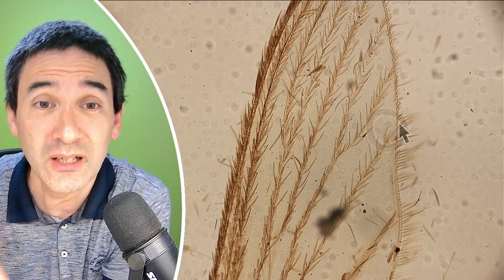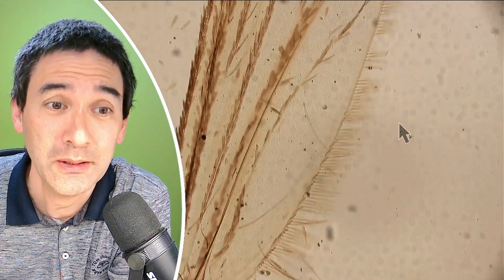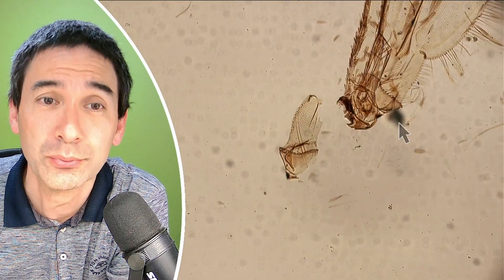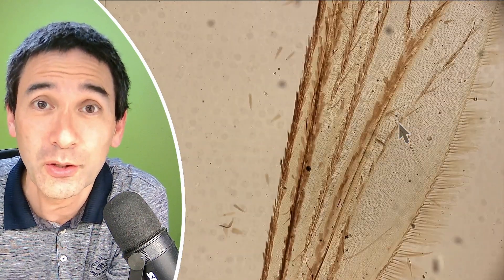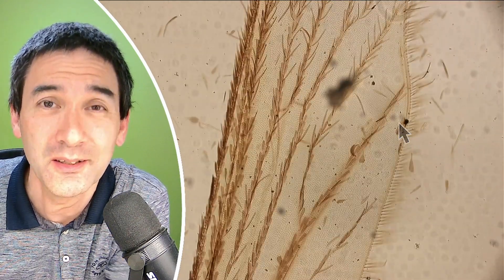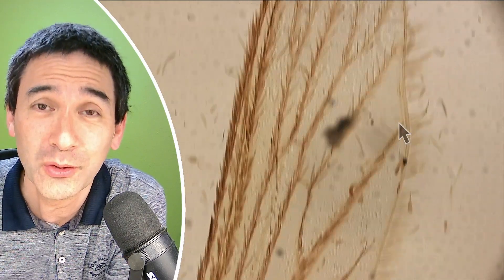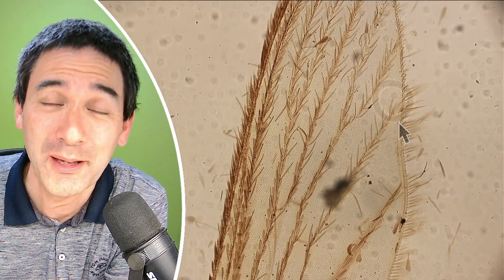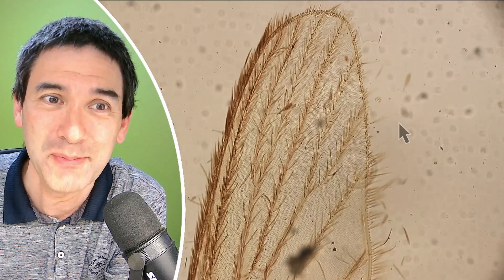Now, of course, I have to tell you. Also not a very nicely prepared specimen. Look, also fractured and broken. But at least we're able to see all of the relevant biological details. And this basically means I'm going to go out now and find a mosquito myself and do a proper microscope slide from the specimen.